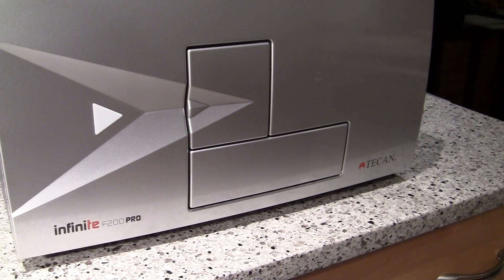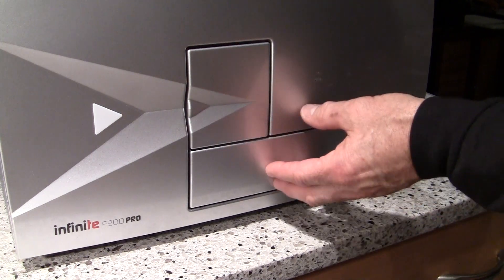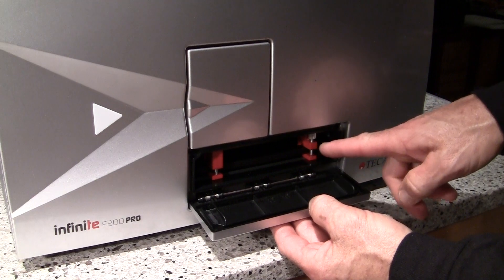Hi, and here's a brief overview of how to remove the transport lock from your plate reader once it arrives in the lab and you have it out of the box. There are two transport locks used to hold the plate tray in place during shipment. The locks are located here and here.